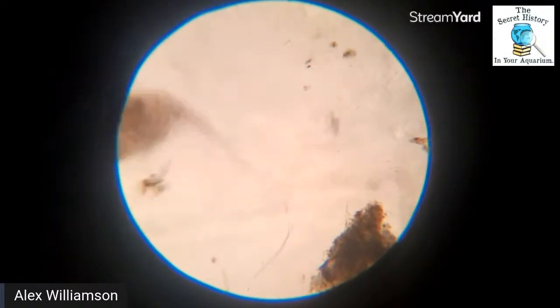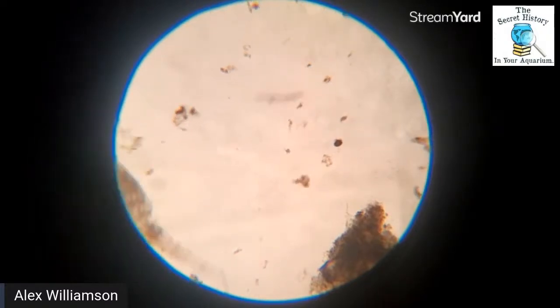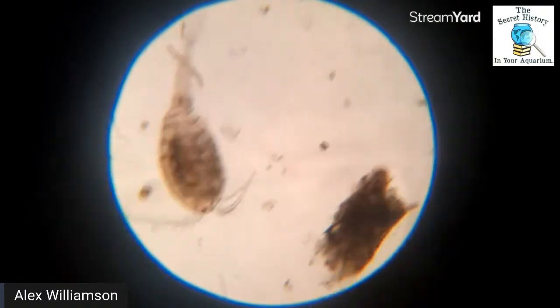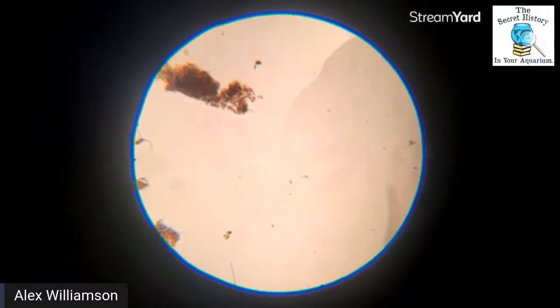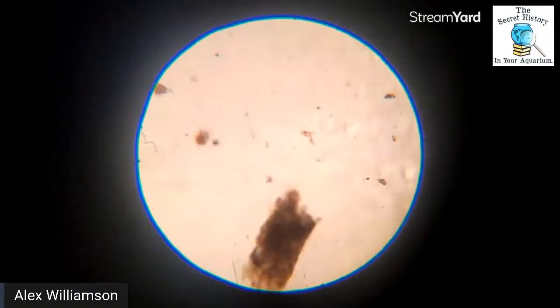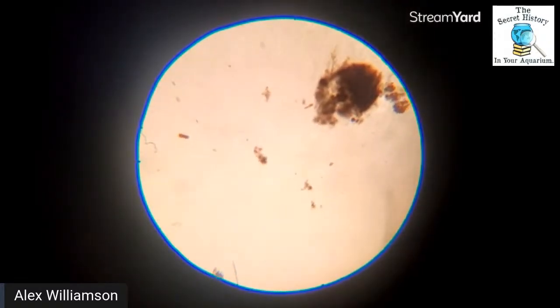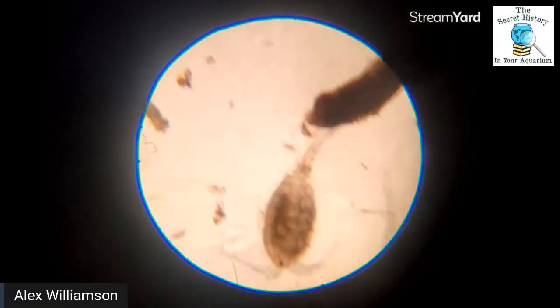Happy Cyclops Day, everybody. Pretty cool. So, let me get the water even lower, so we can try to catch a better glimpse of Mr. Copepod. All right. Now he's basically skimming the water, so we should be able to get him to stay in an area, but he might be flipping around when we find him. Here we go. There we are.